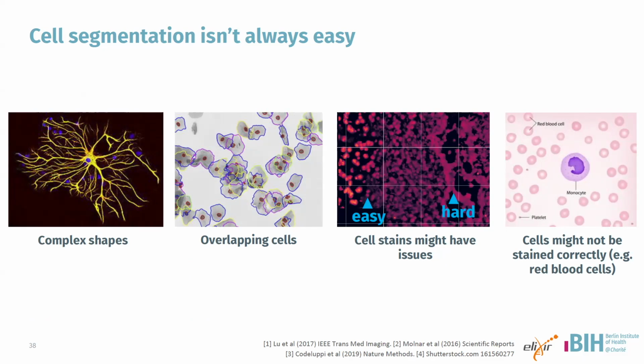I honestly don't want to develop an algorithm that can accurately segment that. This is going to be super challenging. You have the nucleus here in the middle. You have all of these processes extending. The astrocytes play a structural role, so they're not just isolated. They're supposed to be touching other cells. And I don't think you see it so well, but you have these tiny patches of blue, and these are the nuclei of other cells. So this is really not a fun cell type to work with if you want to draw an accurate border.